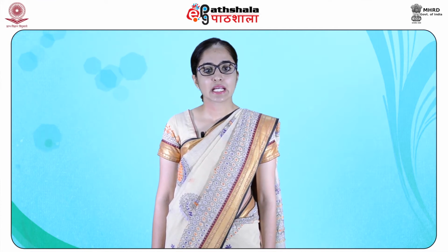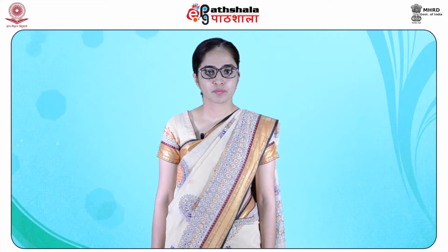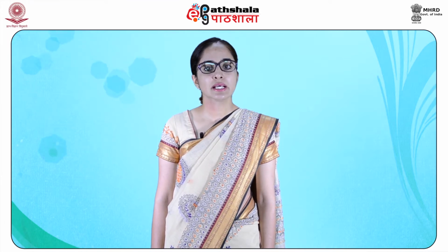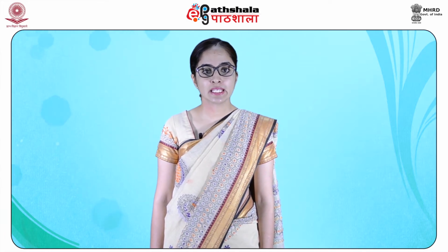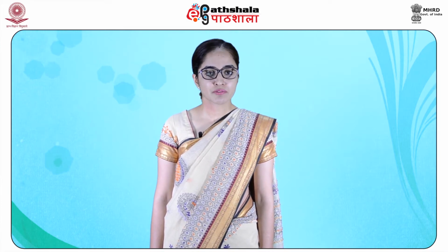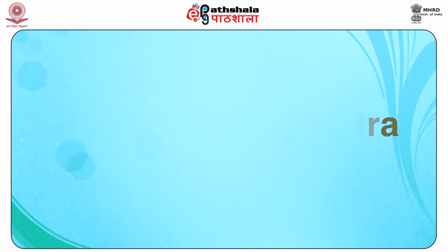Therefore, at high field strength, most proton NMR spectra become first order. It is important here, students, to notice that high field NMR instruments give better resolution and relatively easily interpretable spectra. Now, let us shift our focus to the second order spectra.